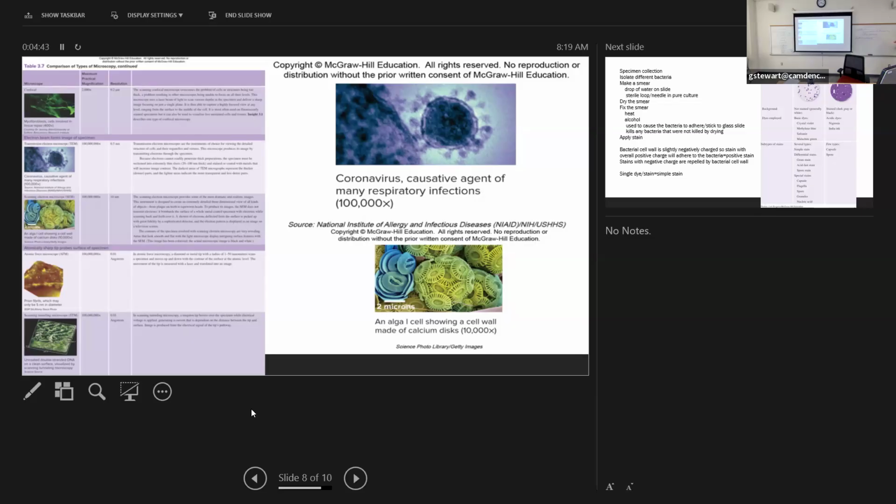They're called electron microscopes because they utilize the particle form of light rather than the wave form, which we've mostly talked about before, the wavelengths of light that are illuminating the specimen. This has to do with something that can generate enough electrons that can actually poke at the specimen, right? So they're going to literally bounce off of the specimen, and that action is going to be recorded and turned into an image. This is a machine that takes up a small room, takes up a closet, okay?